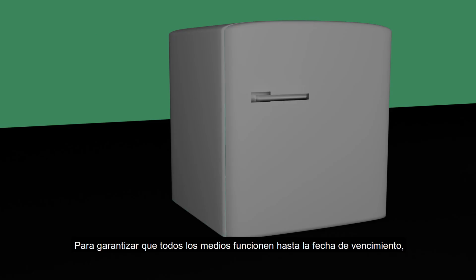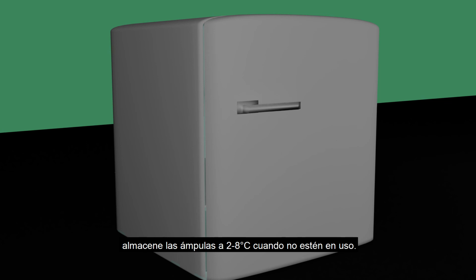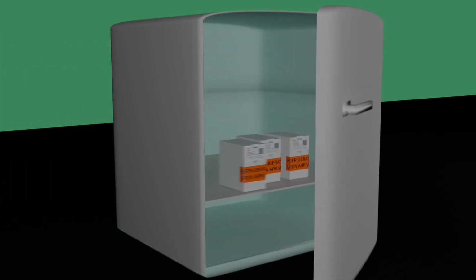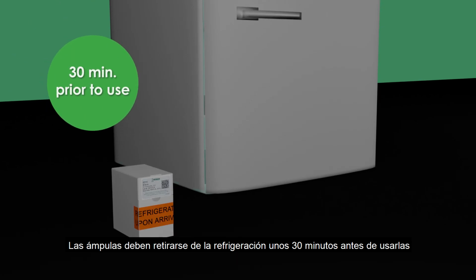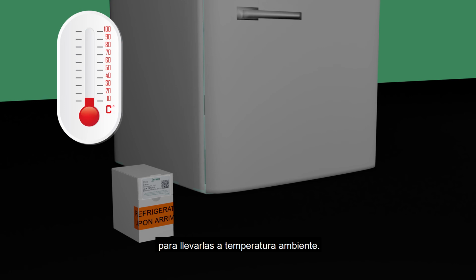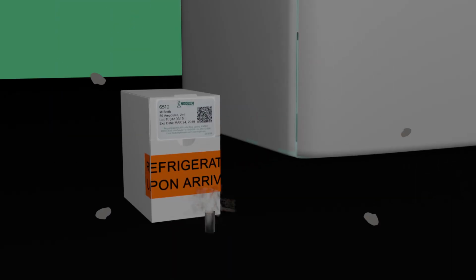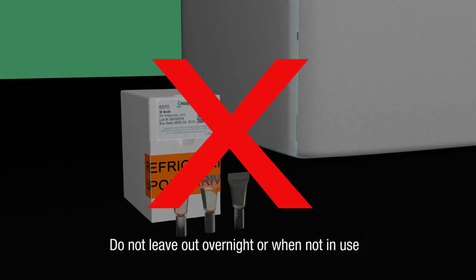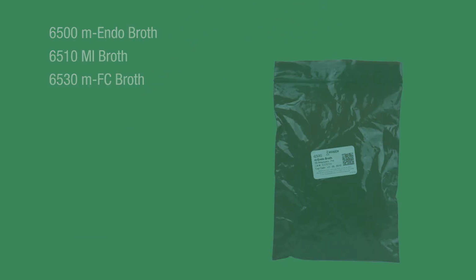To ensure all media performs until the expiration date, store all ampules at 2 to 8 degrees Celsius when not in use. Ampules should be removed from refrigeration about 30 minutes prior to use to bring them to room temperature. This helps prevent brittle ampules as well as cracking. Do not leave ampules out overnight or while not in use. Keep all light-sensitive ampules inside their protective bags.